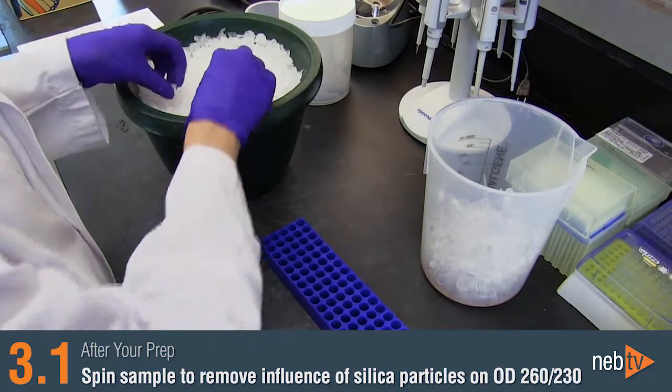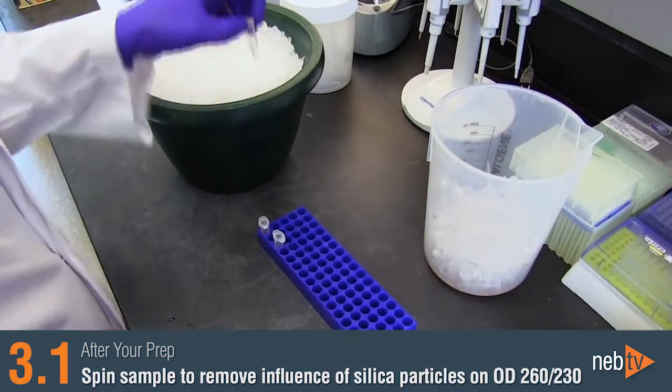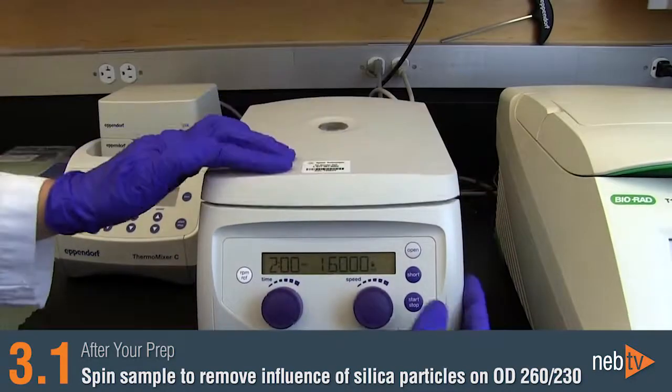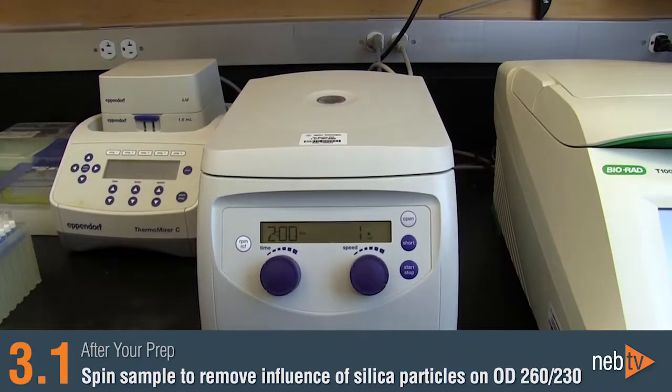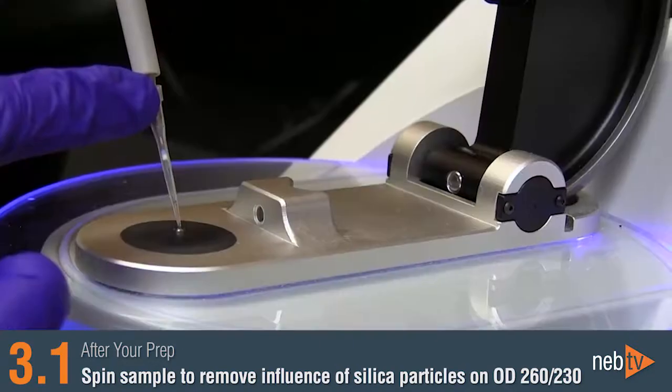In some cases, silica particles from the column matrix can be found in your eluate. To ensure that this doesn't affect your OD260-230 ratio, you can centrifuge the eluate for one to two minutes at 16,000 times G and pipette the aliquot from the top of the liquid for measurement on a spectrophotometer.